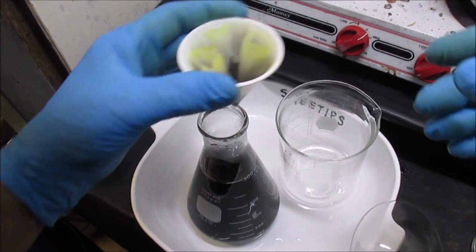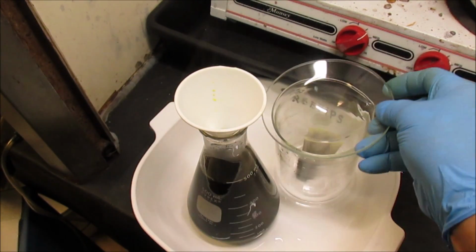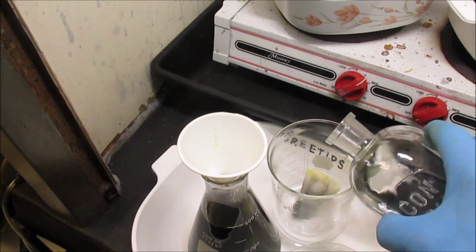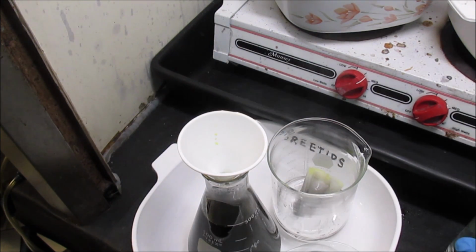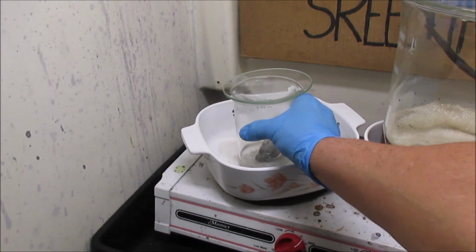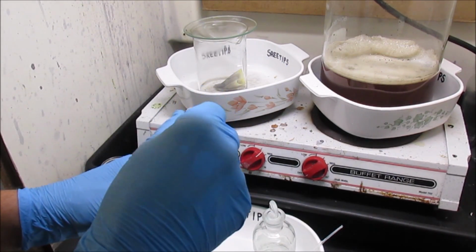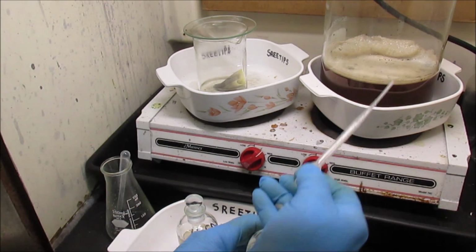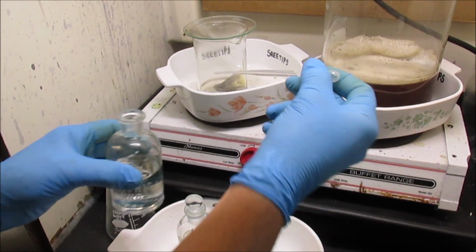Alright, now we're going to take it out of the funnel, put it back in the beaker, put it up on the heat. First let's put some hydrochloric acid in there, about 50 ml or so. Put it up on the heat. Add about a half ml of concentrated sulfuric acid for the lead, if any. And then we're going to add about 4 ml of concentrated nitric acid to form aqua regia in there and dissolve that gold one more time.